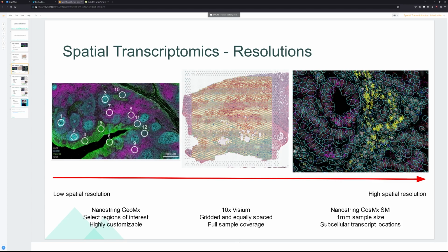So we can see whether or not transcripts associated with the cell cytoplasm or nucleus are more abundant in a particular sample, or what have you. There's just so much more that you can do. Transcripts co-localizing, but it's very cool.